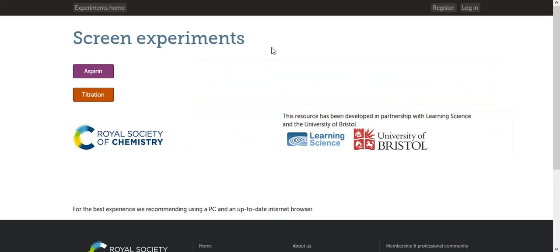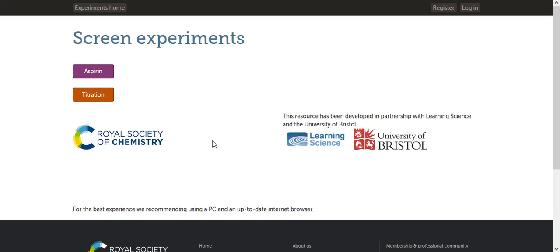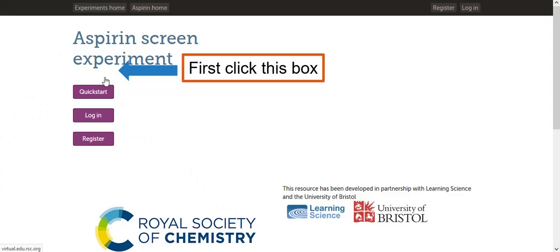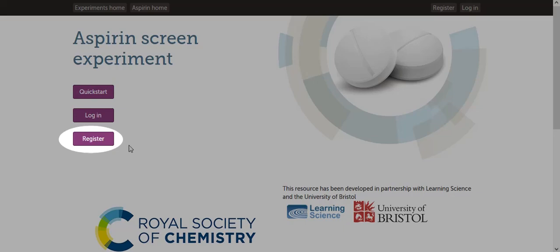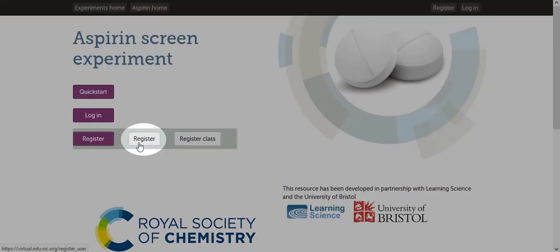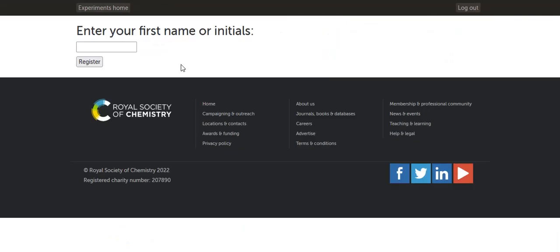After you open the link, you should be seeing this page. Before you begin the virtual experiment, you first have to set up an account. This is really quick. First, click this purple box with the word Aspirin on it. Next, you want to click this register button. You have two options — click the first one. Now write your name in this box. Please write your first and last name and then click register.